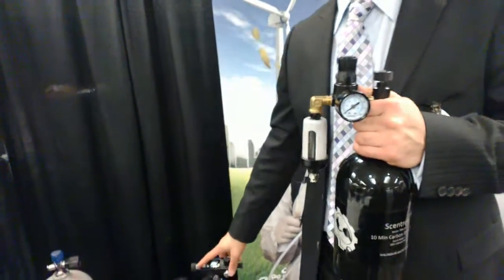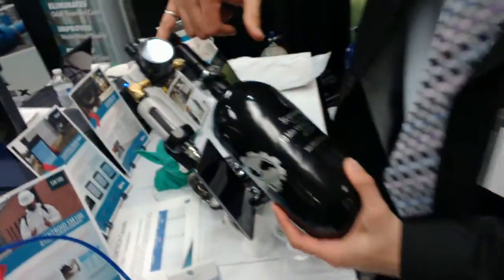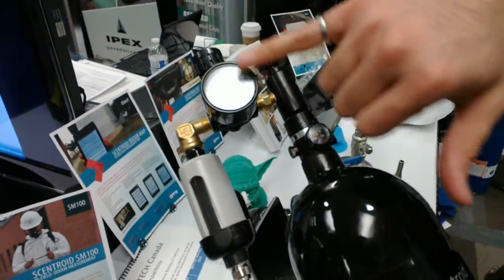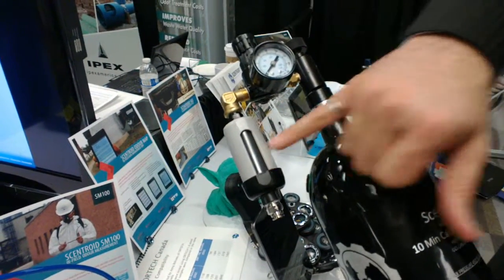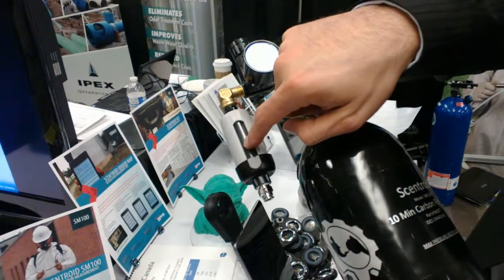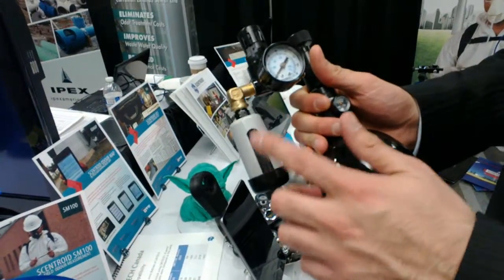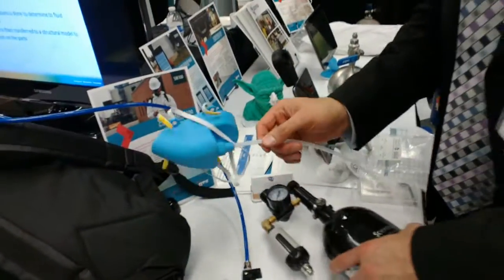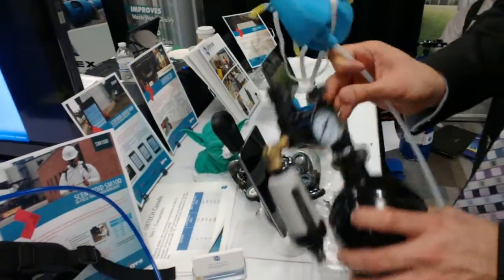The big tank can fill the little tank about 20 times, so you can get 400 to 600 samples per scuba tank. The air goes through a pressure regulator at 80 psi, and then through a second filter. There shouldn't be any smell in the compressed air, but just in case, the active carbon filter will remove it. That's why the filter usually lasts at least a year — it's not really doing that much.